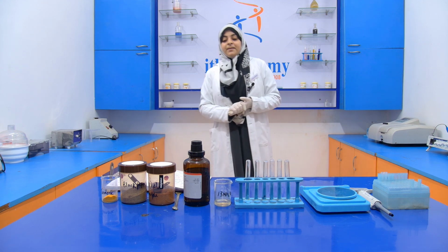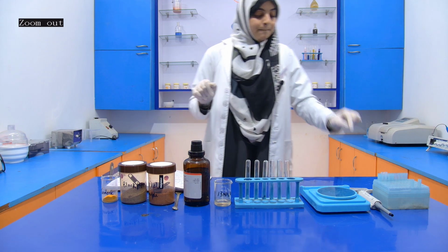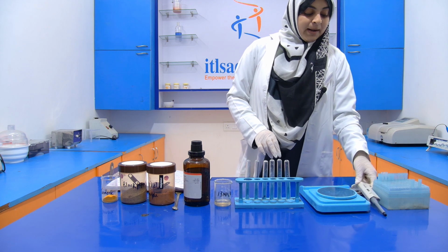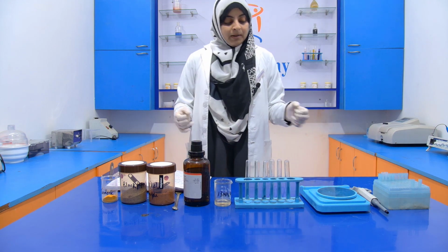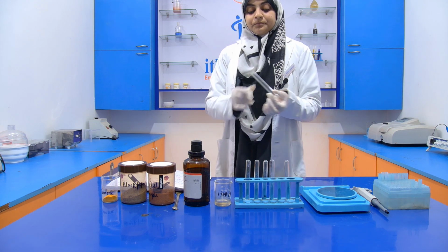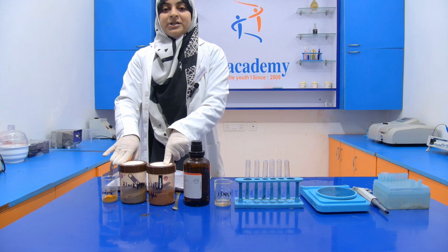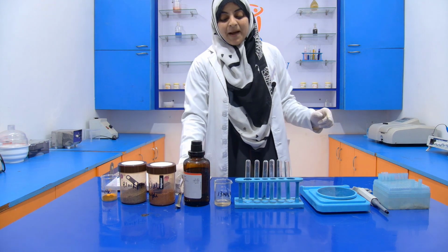Now come to the experiment. For performing this experiment, we require this setup. We require a micropipette of 1000 microliter or 1 ml. Then we require a micropipette tip. We require a weighing balance for weighing the sample. We require aluminum foil. We require test tubes obviously for performing the experiment, and a test tube stand. Then we require these three samples: red chili powder, black pepper and turmeric. Then we require a spatula.